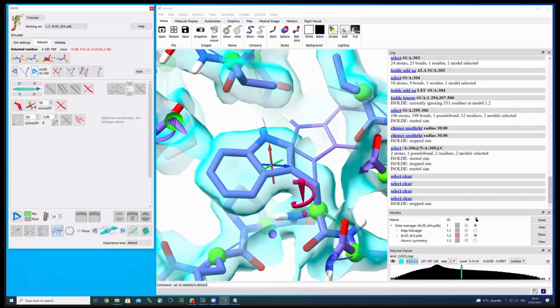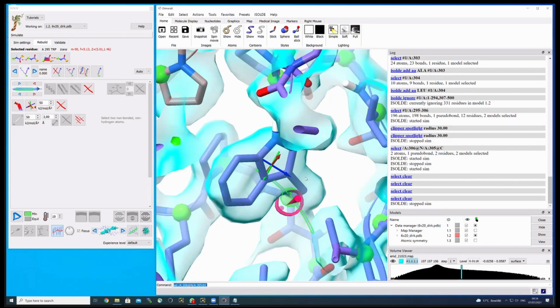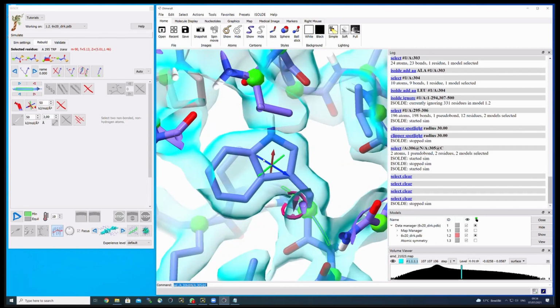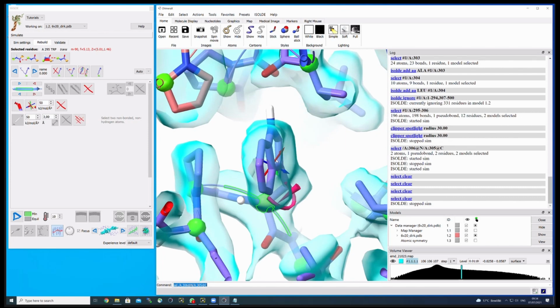None of them is the correct one that I actually need for this specific purpose, and this is why also the residue properties that are shown here say the rotamer belongs to the group M-90, and you can see that this is a clear rotamer outlier, but it's very well covered by the density, so it's all fine to model it like this. It is very well represented by density, a rotamer outlier in this model.